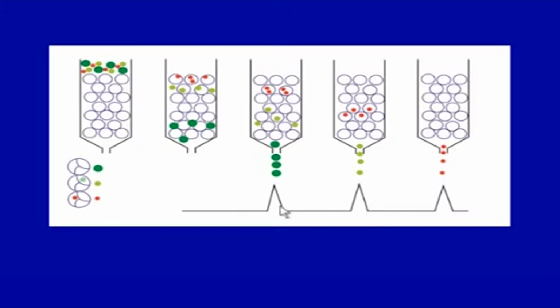The next one shows how peak resolution can take place if their molecular sizes are far apart. They can be easily separated into different fractions and utilized for different applications as a purified product.